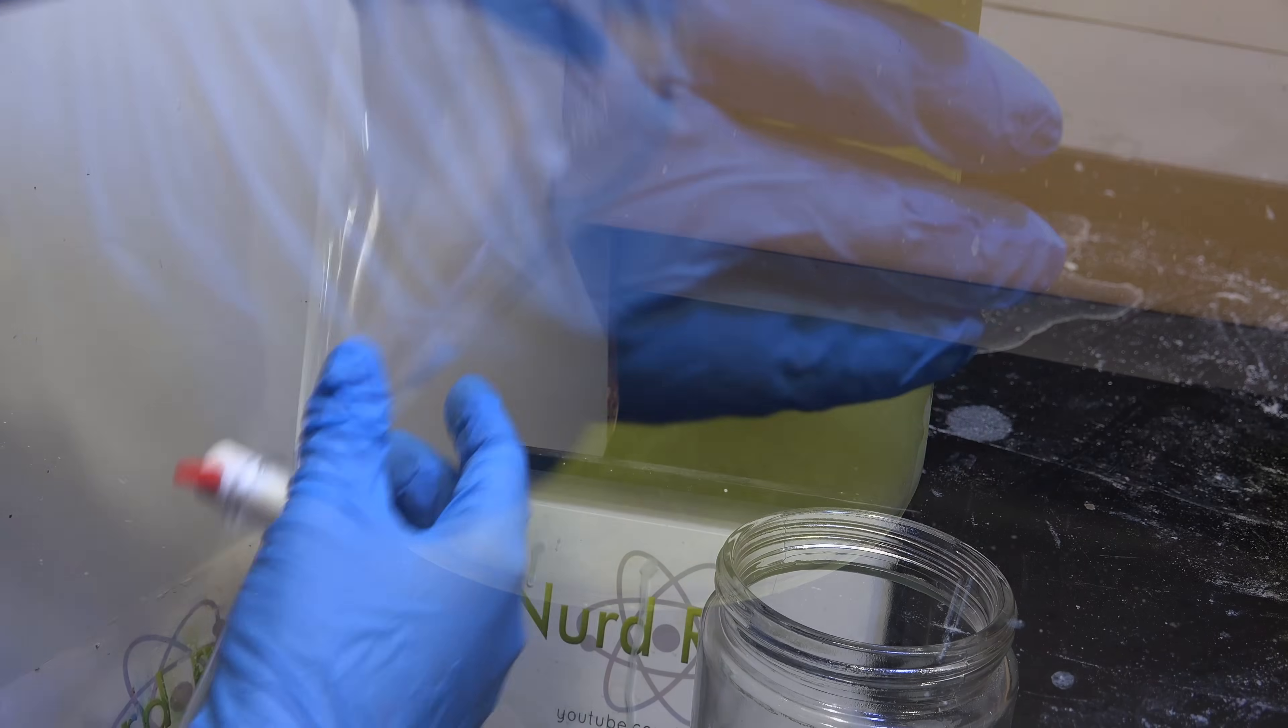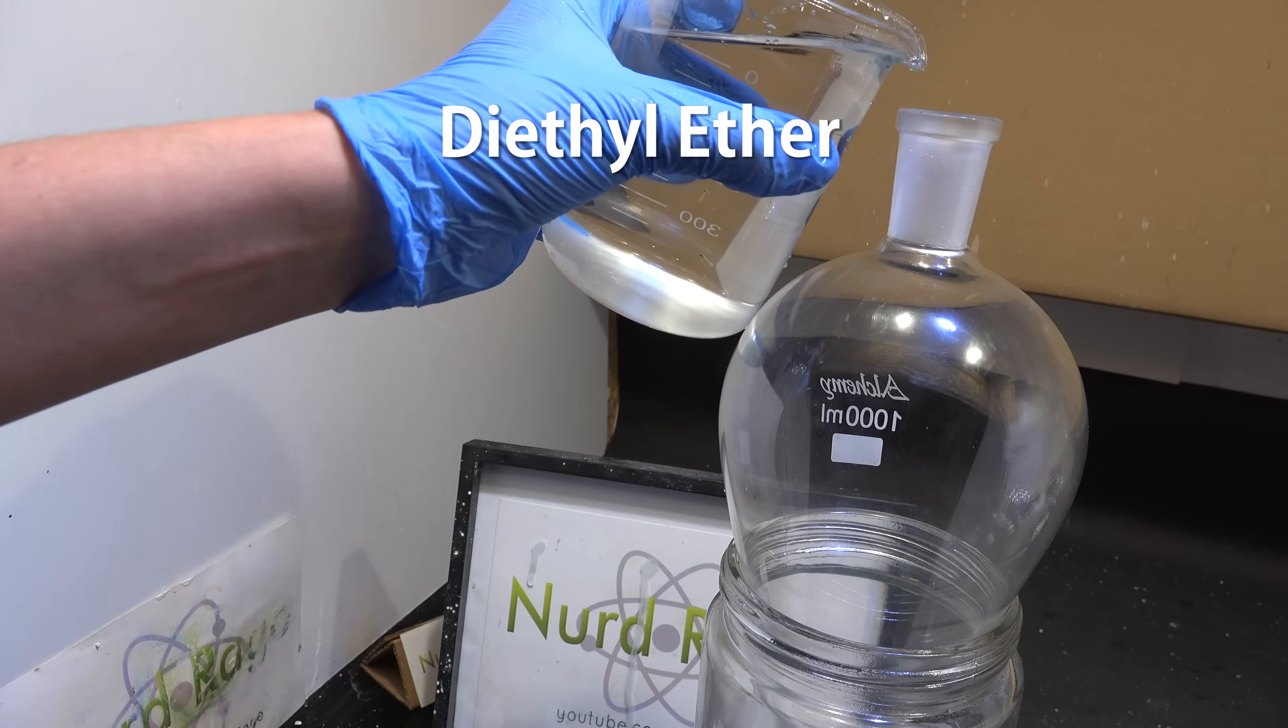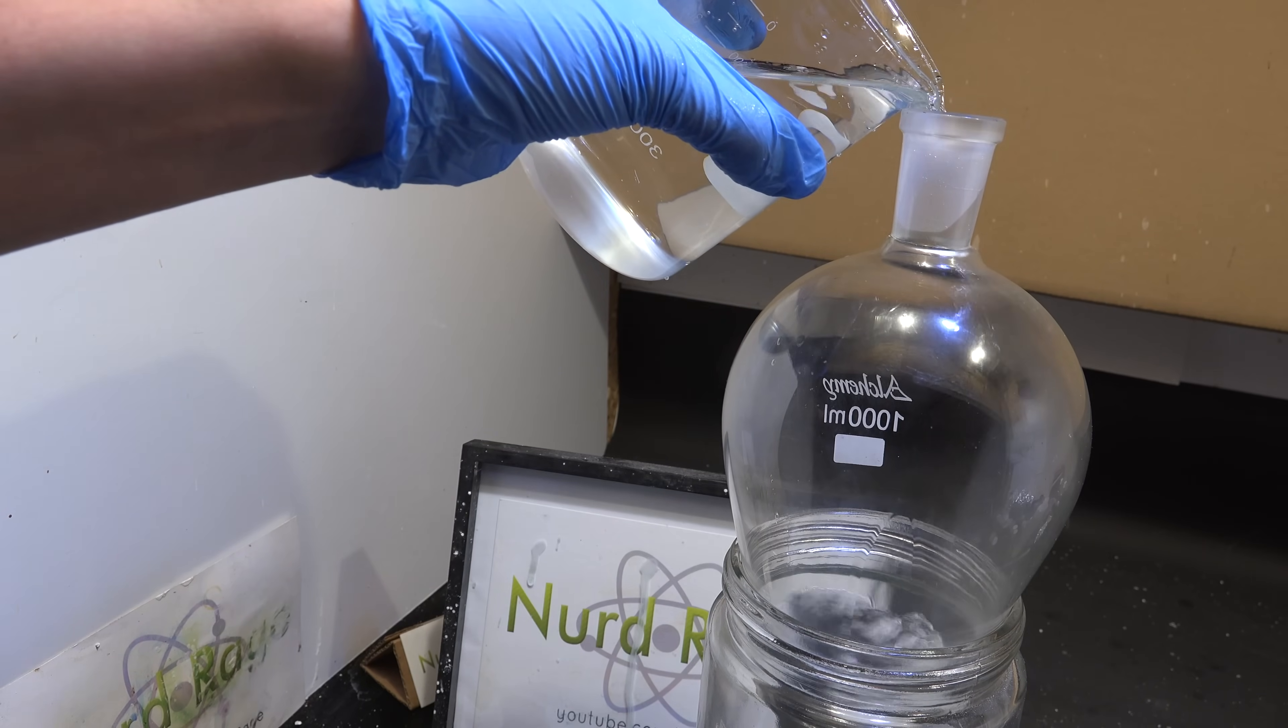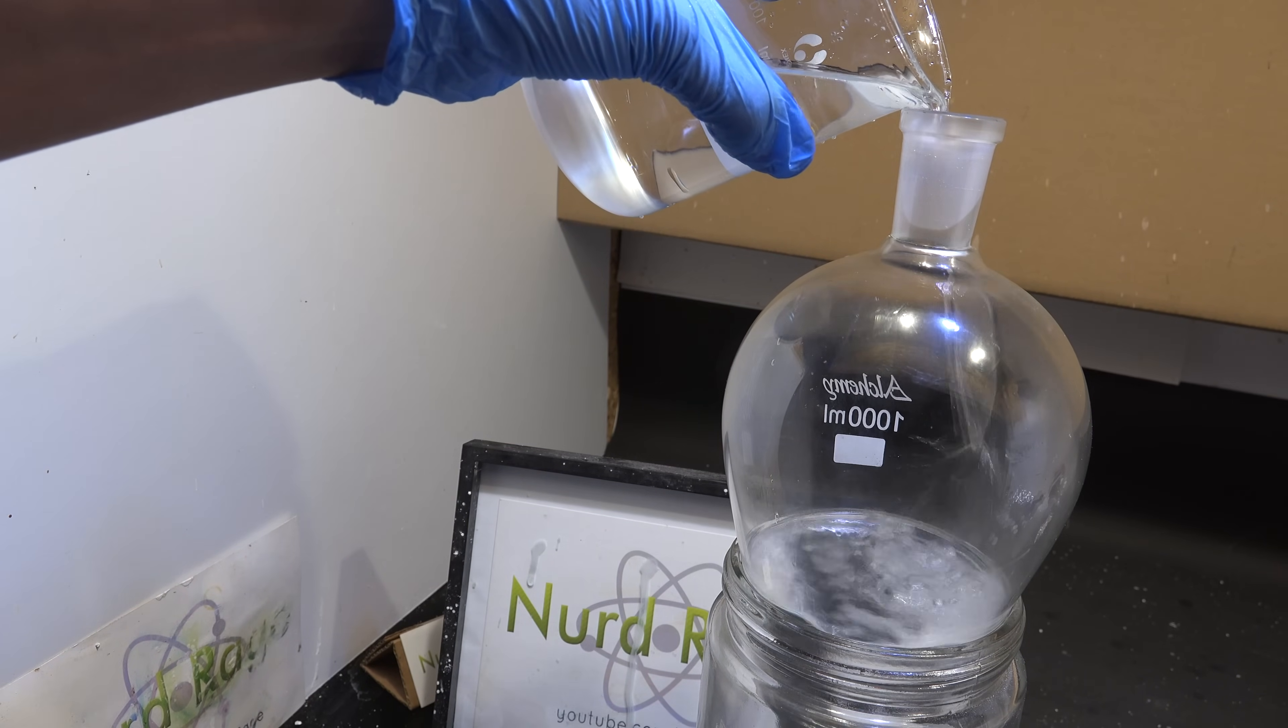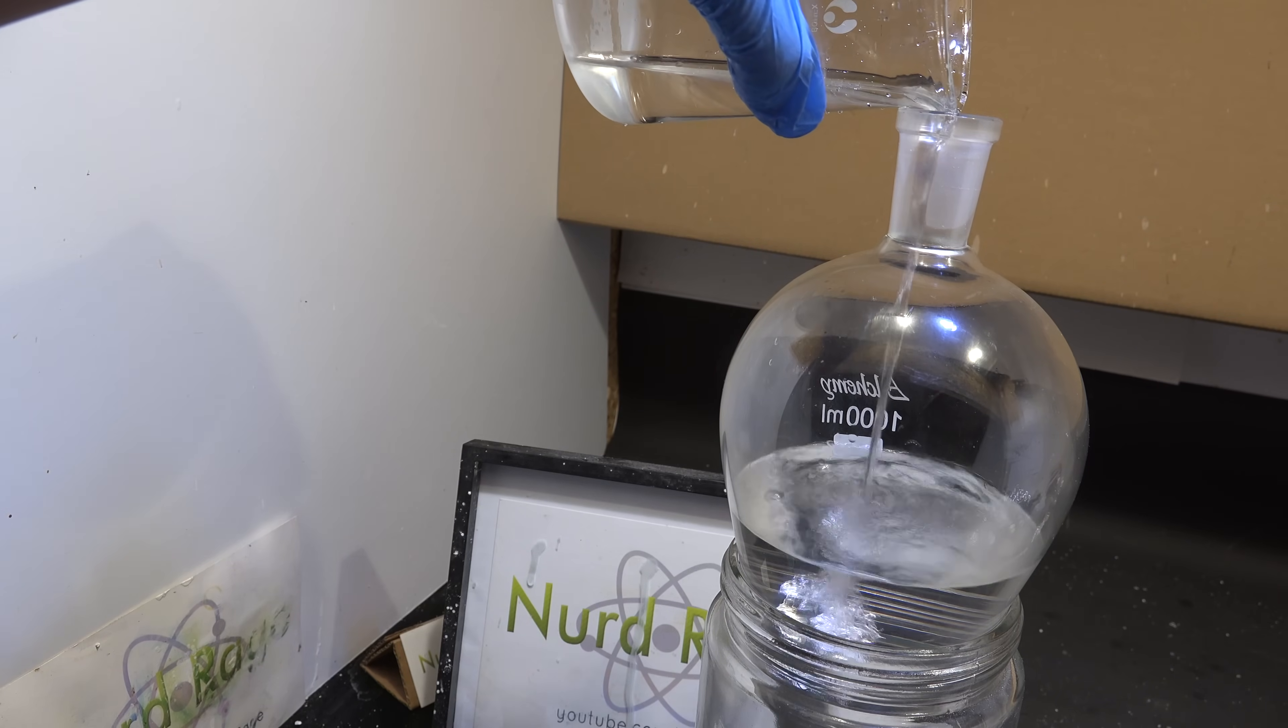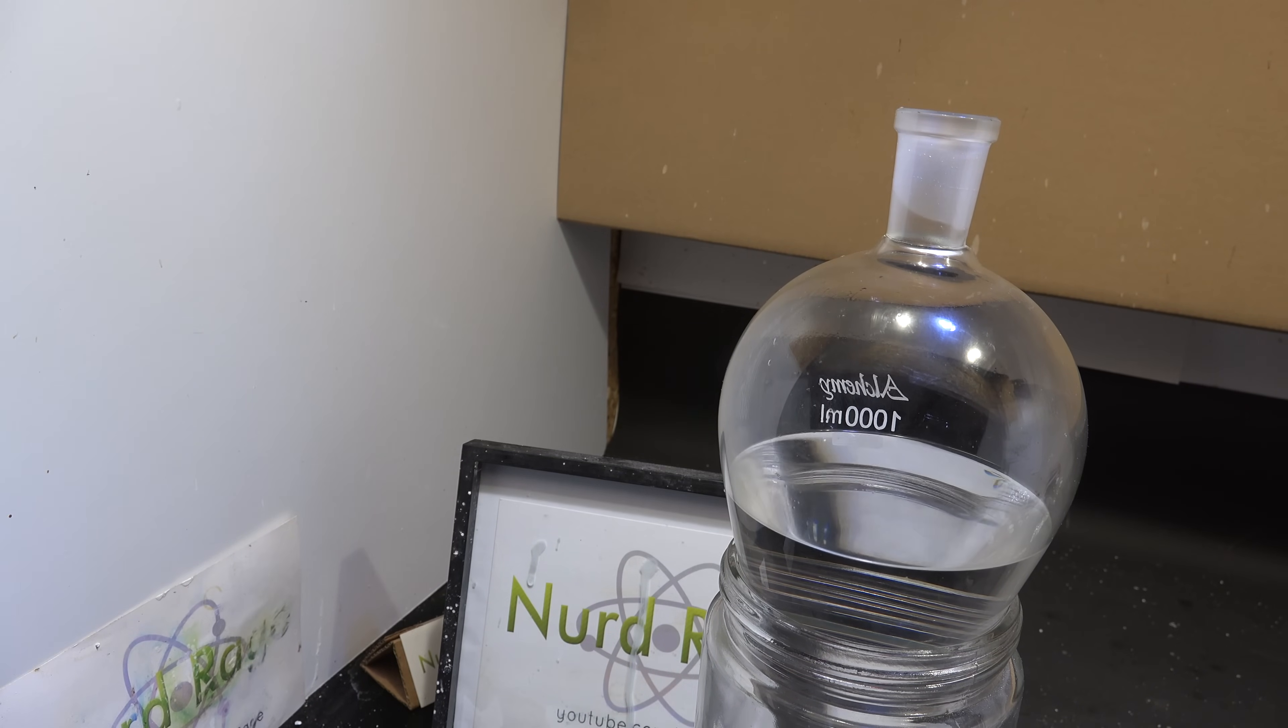Now you're going to need a large separatory funnel. We fill it halfway, in my case 500mL, with diethyl ether. I got most of mine distilling it off starter fluid as shown in a previous video. Diethyl ether has a low boiling point of just 34.6 degrees celsius so on a hot day like today you can lose a lot just from evaporation. It's also a tremendous fire hazard being so volatile and flammable. So when doing extractions it's a good idea to pre-chill it in the fridge if you can. This helps to keep the vapors under control.